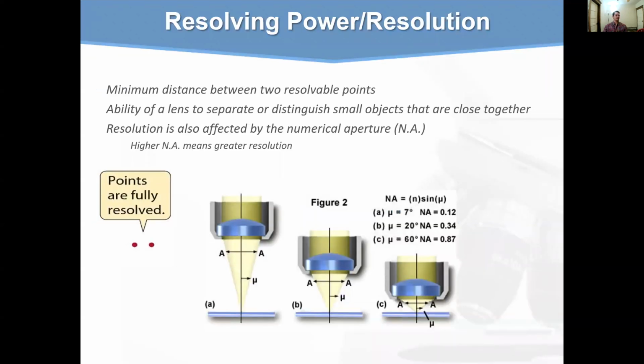Okay, so getting back to our useful magnifications. Just as a reminder, remember that the range of useful magnification for an objective or eyepiece combination is defined by the numerical aperture of the microscope system. So that obviously begs the question, what exactly is this numerical aperture? What does that actually mean? A numerical aperture is the range of angles over which a system can accept or emit light.